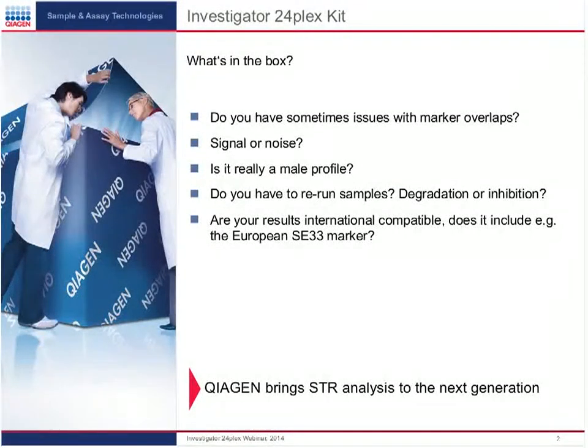So this question deals with the sensitivity. On the one hand, of course, signal sensitivity is due to signal peak height, but is also related to signal to noise ratio to clearly determine an allele. So if you might have a high background in the past, you might have lost some peaks.